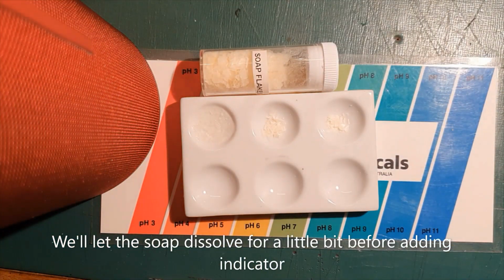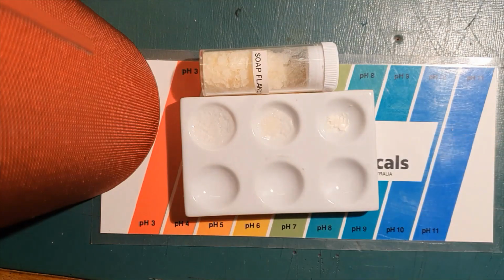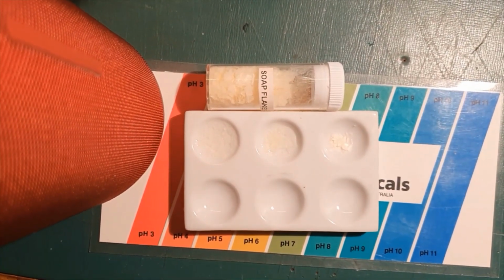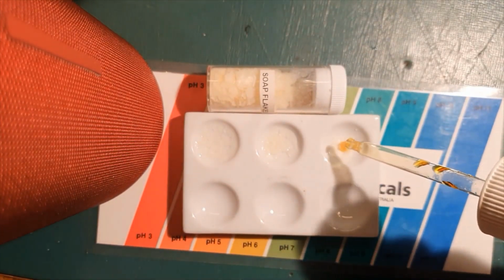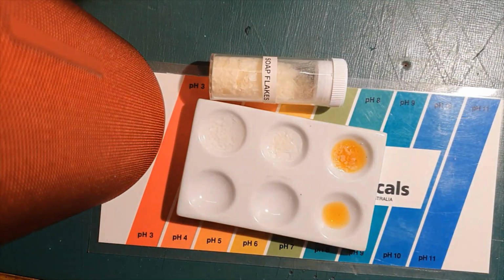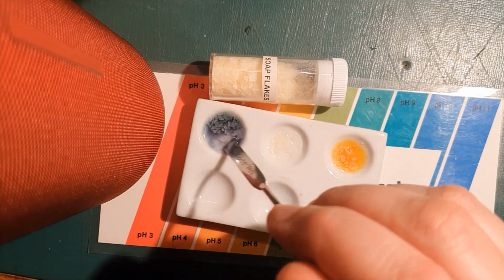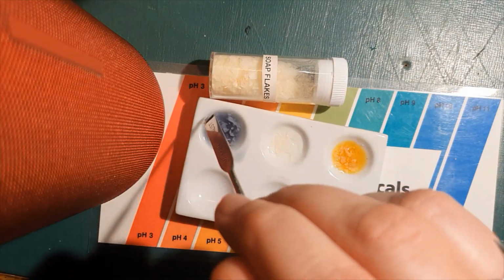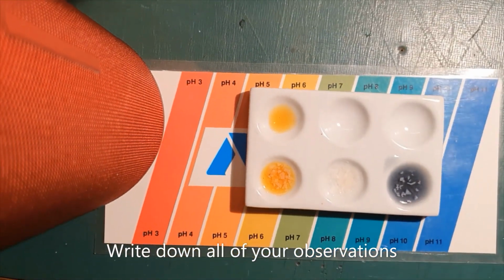I'll let that dissolve for a bit. Let's try the vinegar. Nothing. And let's try the iodine. Also nothing. Add some universal indicator. Test the pH. What pH do you think that is?